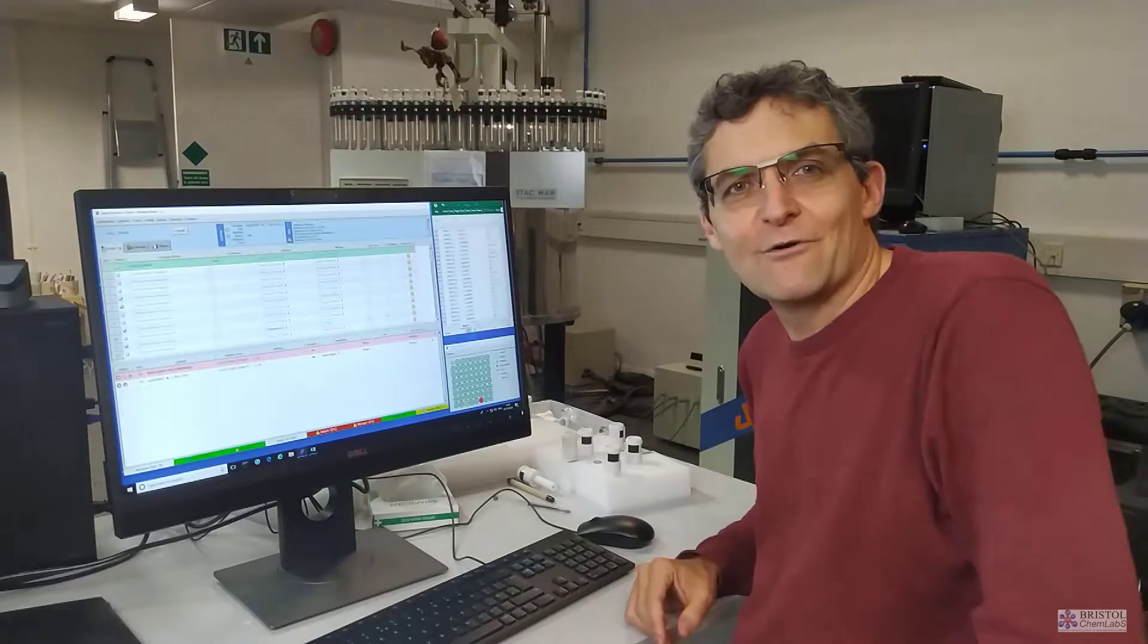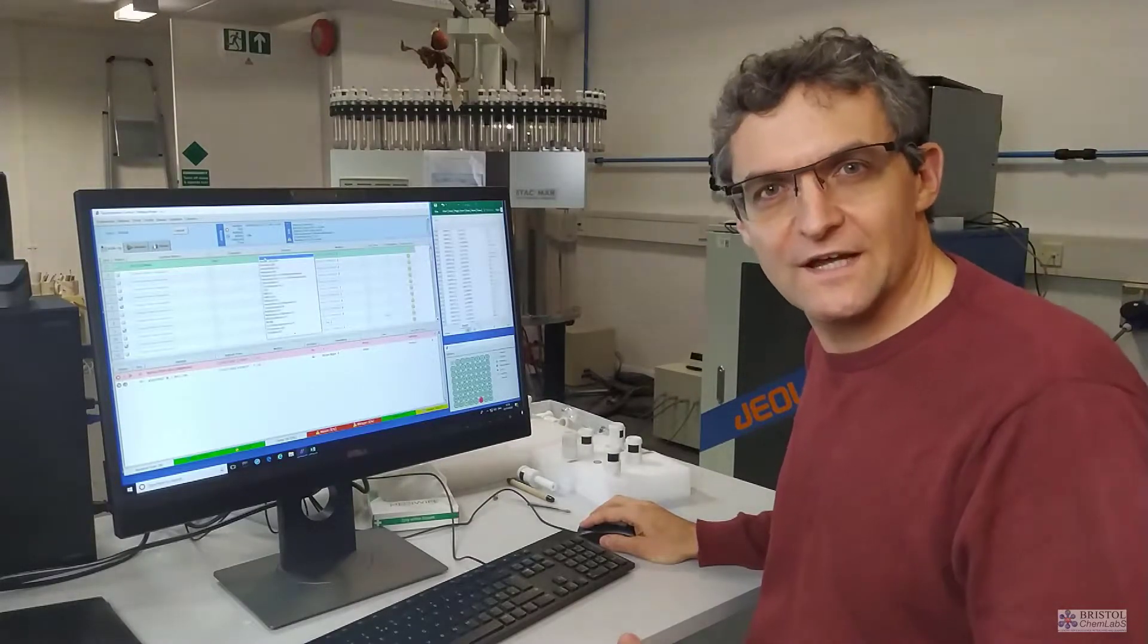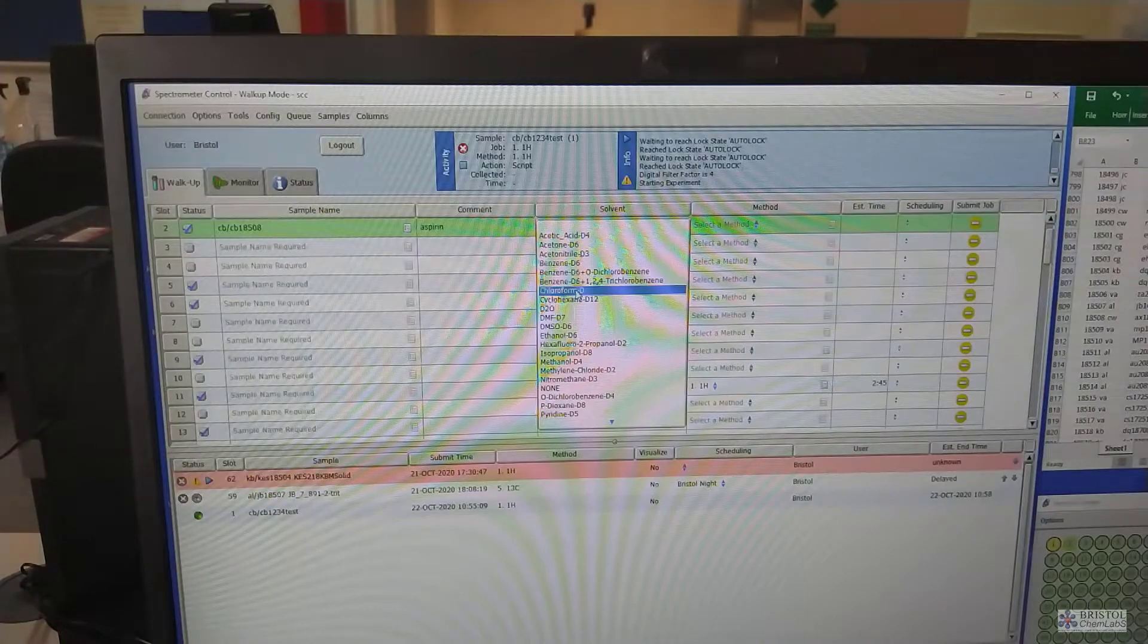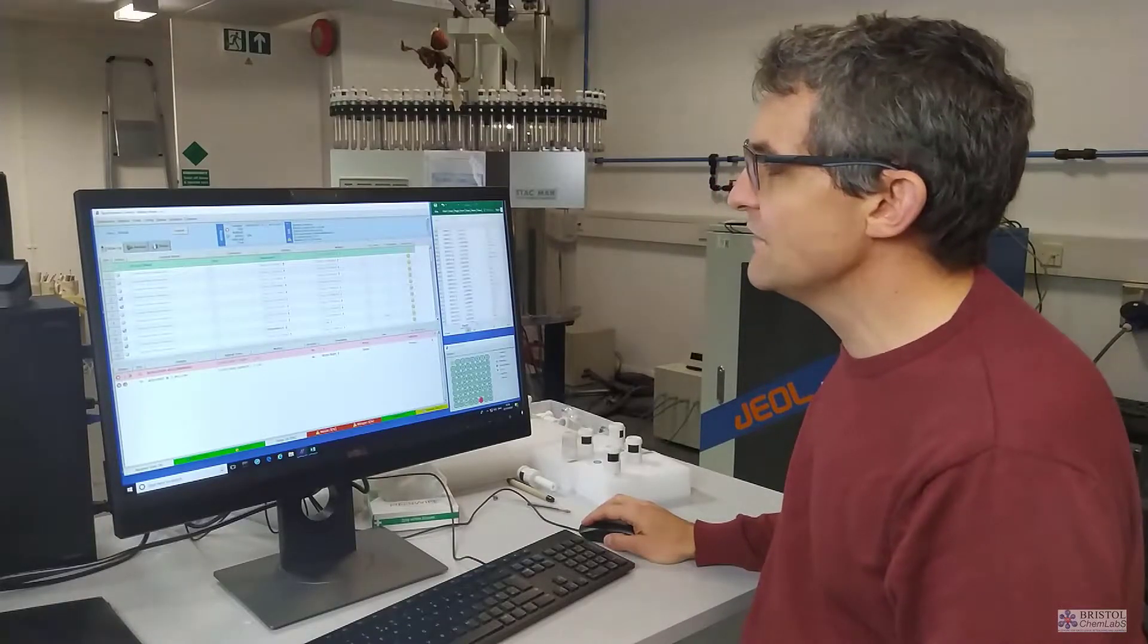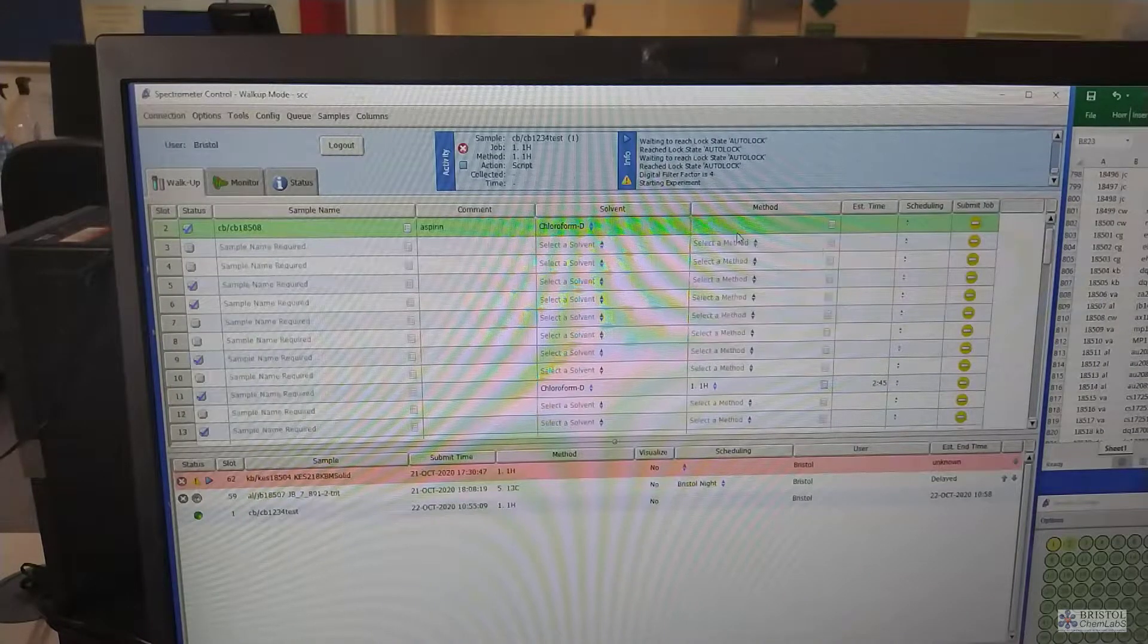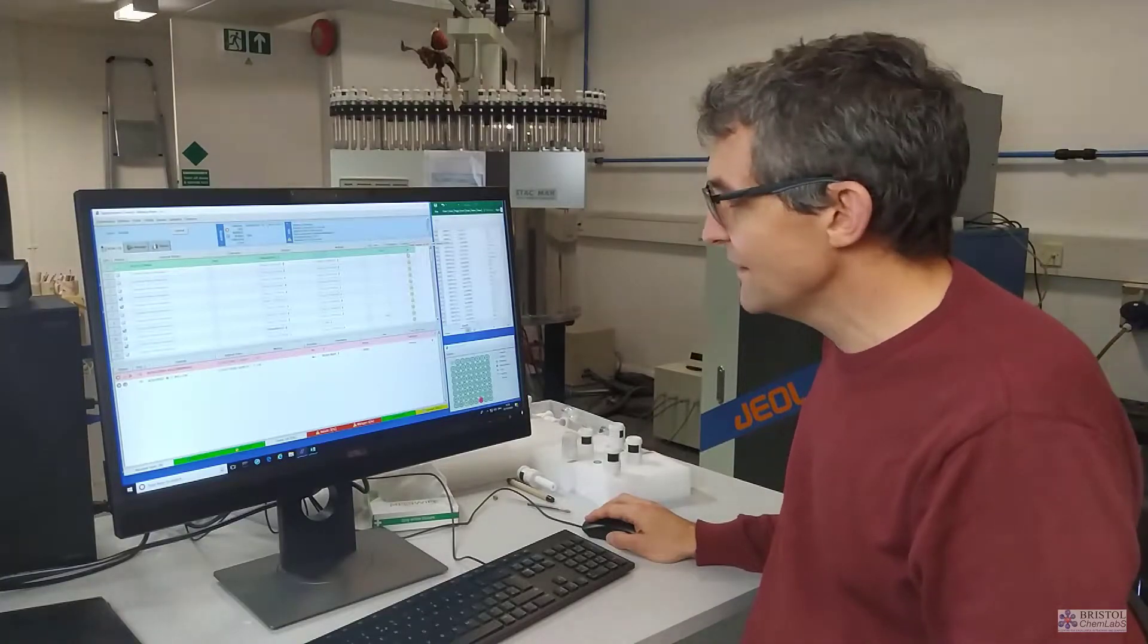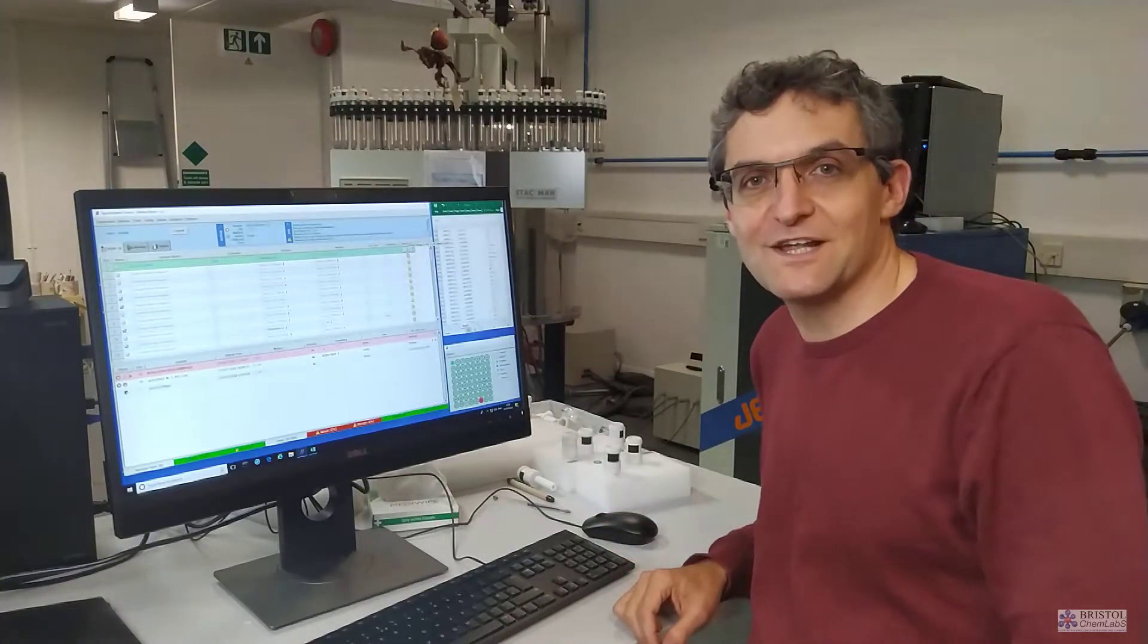When we want to run our NMR spectrum, it's really simple. What we need to do is come to the computer, tell the computer what the solvent is that our sample is dissolved up in. So in this case, it's dissolved in deuterated chloroform. And then what experiment we want to run. So a proton NMR spectrum, or a hydrogen NMR. And then it calculates the experiment time and we push it back. It's as simple as that.